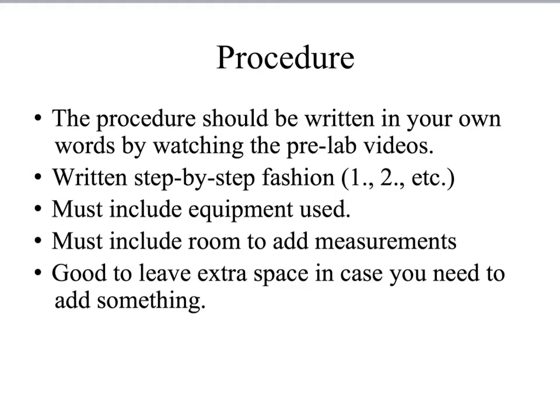The next one is probably the toughest. This is going to be your procedure. So the procedure should be written in your own words by watching the pre-lab videos. You should be writing it in a step-by-step fashion. So step 1, what happened? Step 2, what happened? Make sure that you also include any equipment used. It's going to be awfully tough to come to lab without writing down, well, did she use a beaker or did she use a test tube?